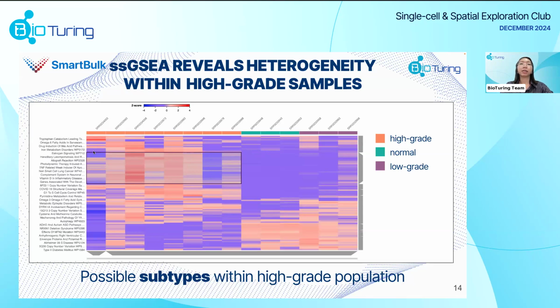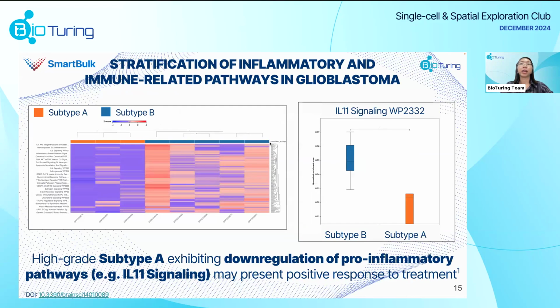So taking a subset of the selection that I've boxed here, I was able to subset this selection and recluster them to get a new heat map, which you see here. So again, what this heat map identified is two particular clusters, the orange and the blue.